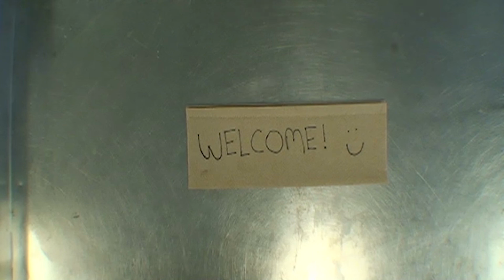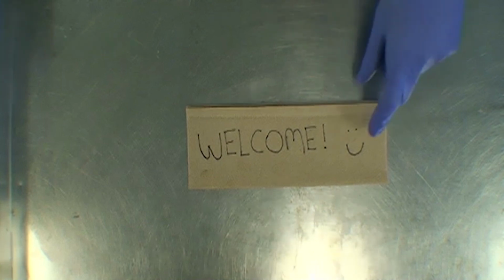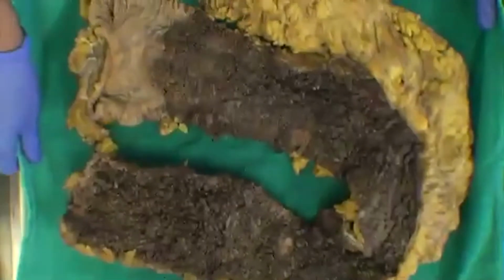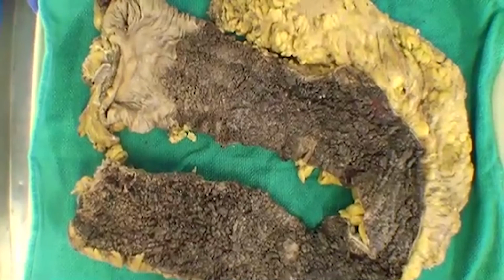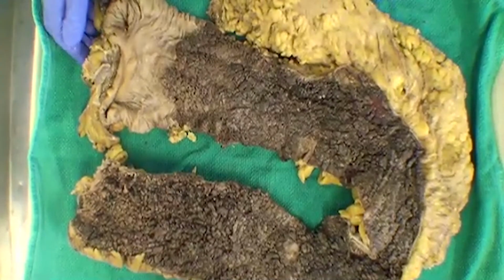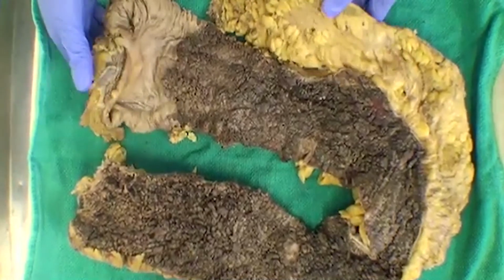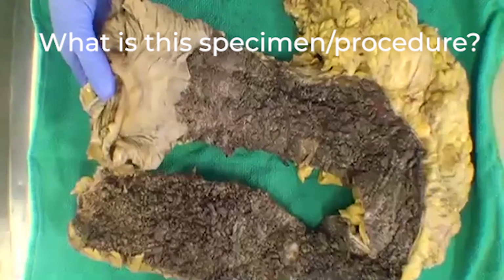So today we have two interesting specimens that are closely related to each other. I guess without further ado, I will put the first one up. Hope everyone feels welcome. Given that we've had a few of these specimens recently of a similar nature, I'm wondering if anyone in the chat wants to comment on, first of all, what they think this surgery is as I display the specimen.